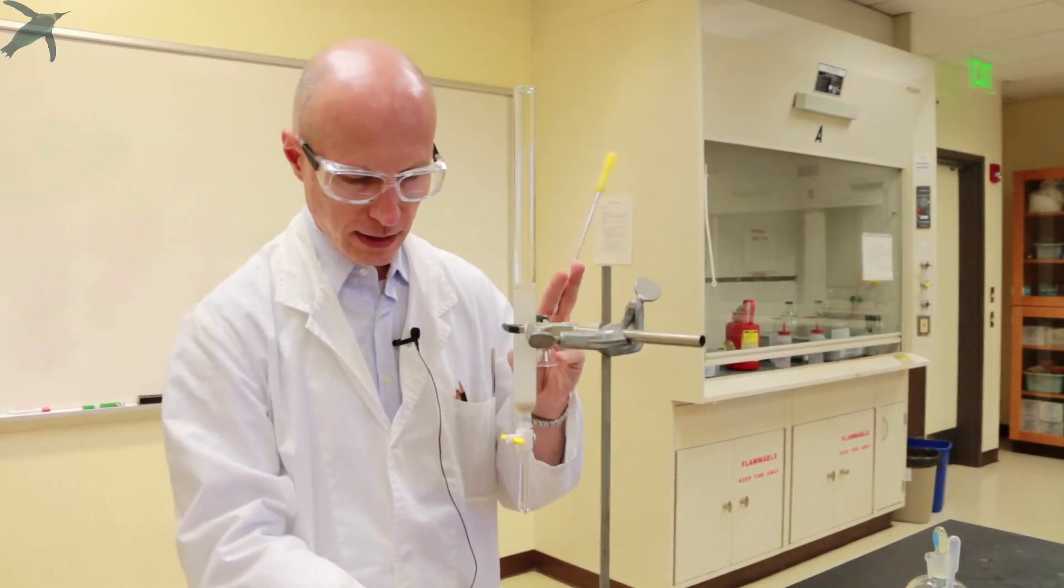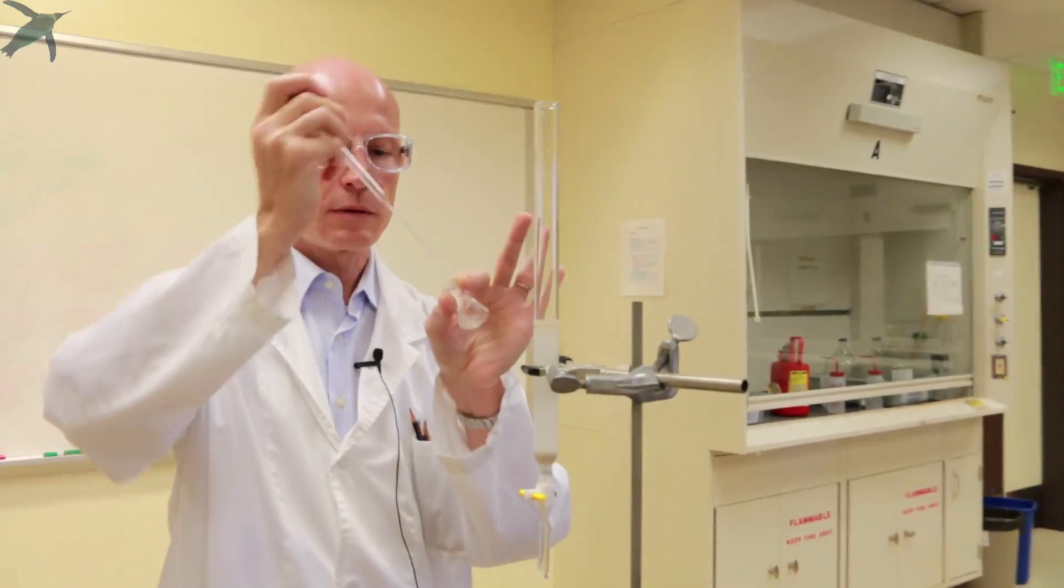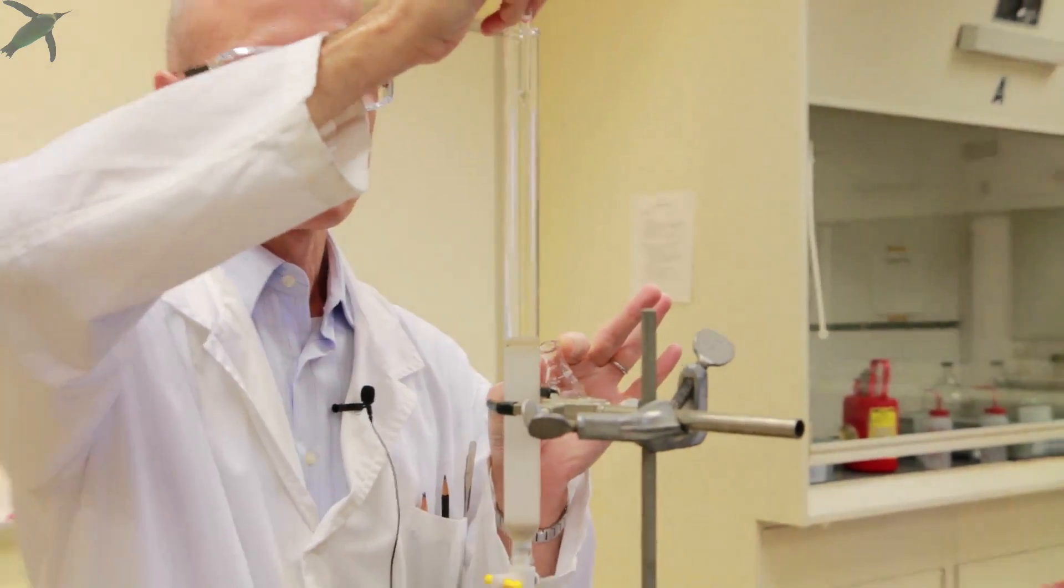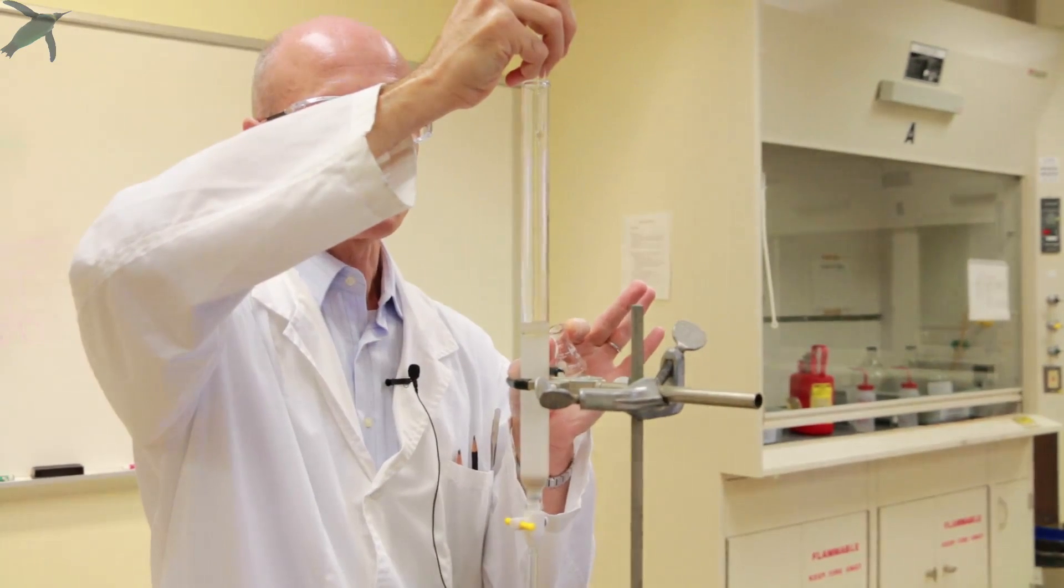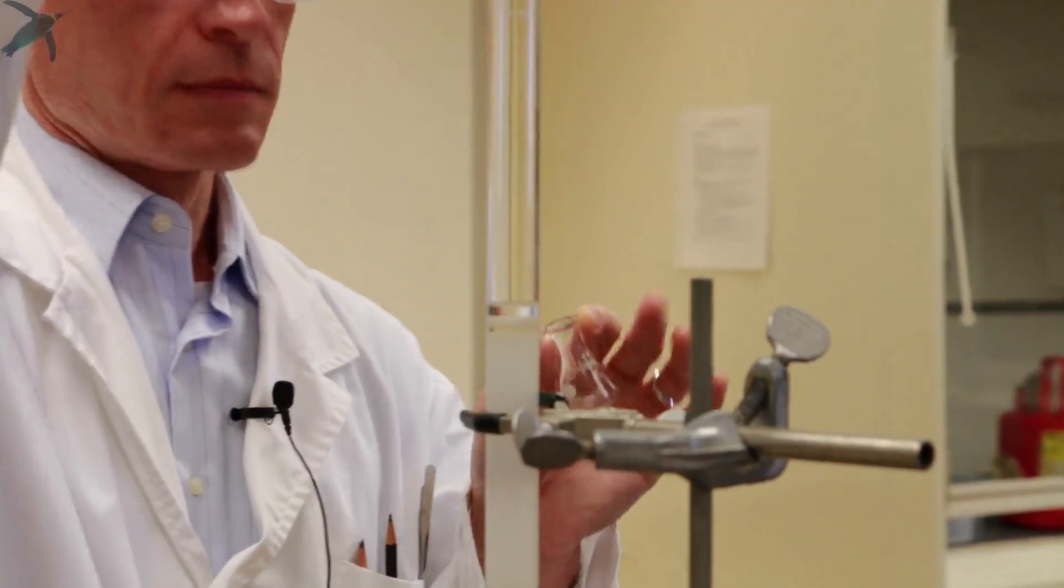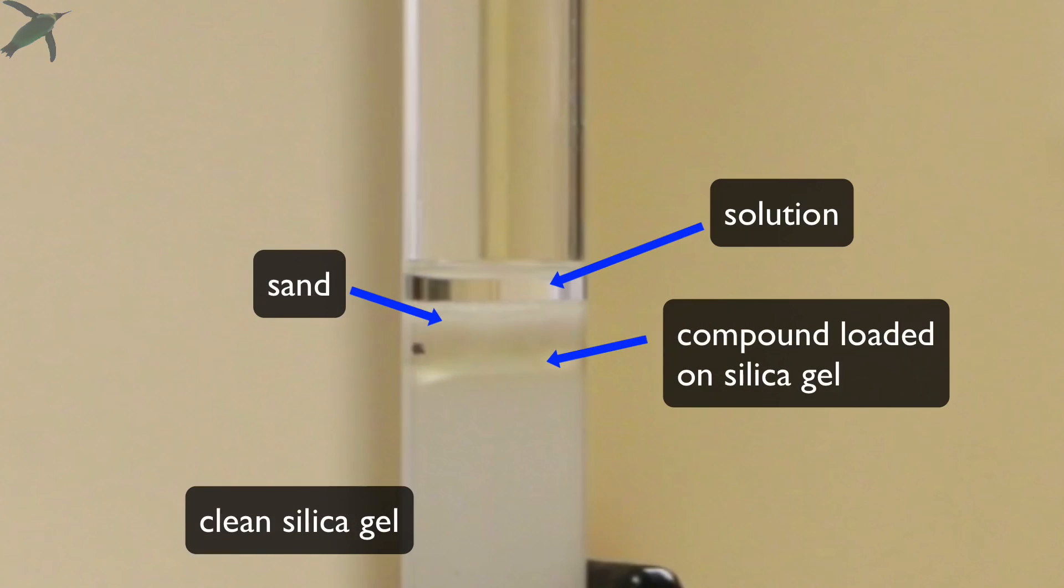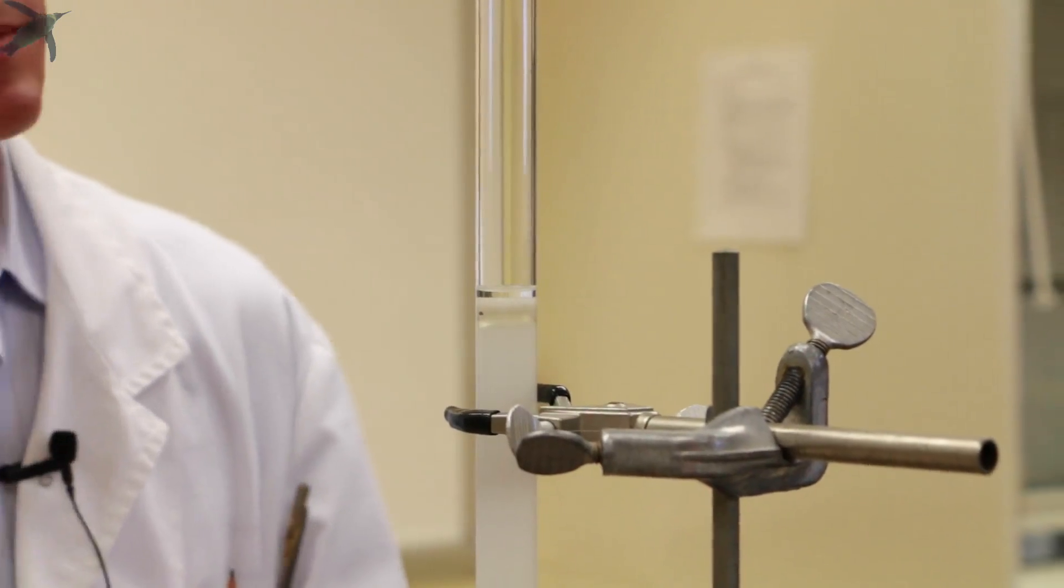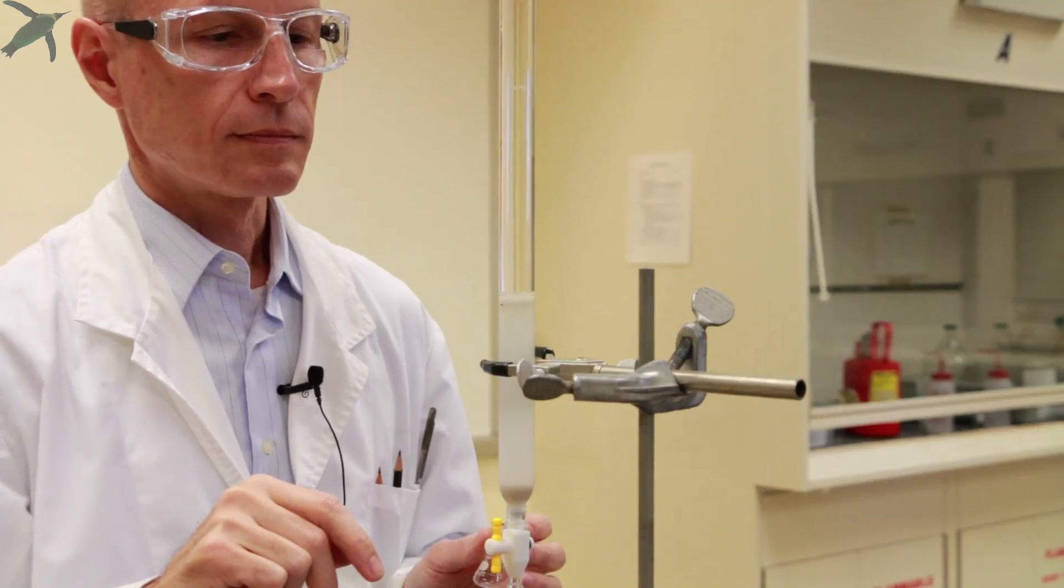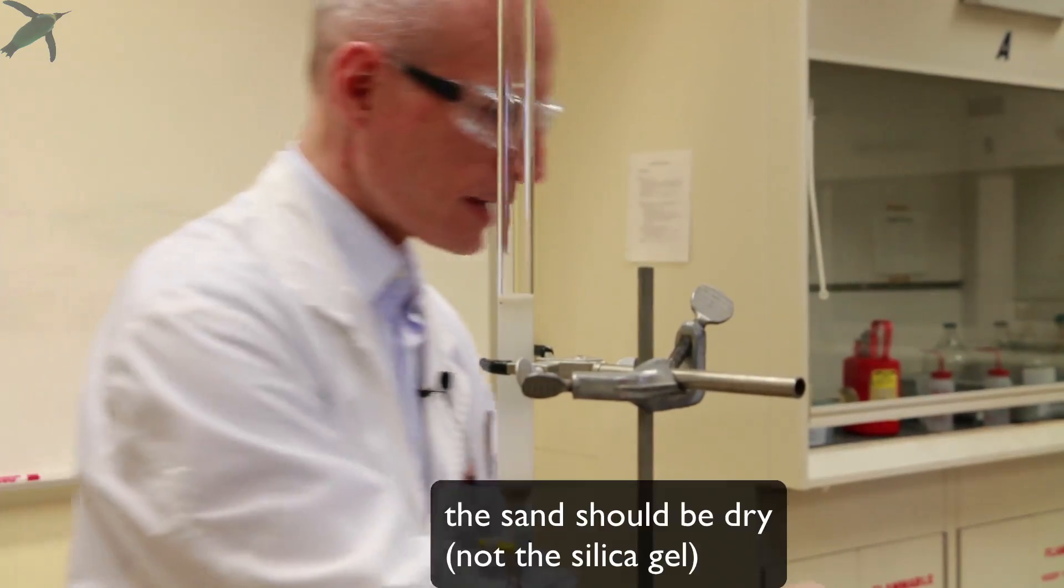So you take a clean Pasteur pipette, you take about one milliliter of solvent, you put it in, and you wash the walls. And then you put this solution again on the top of the sand. Be careful not to disturb the surface of the silica gel when you do this. And then you open the stopcock and you let the solution enter your column. And you go again dry with the silica gel. At this point, your column is loaded and you can start running it.